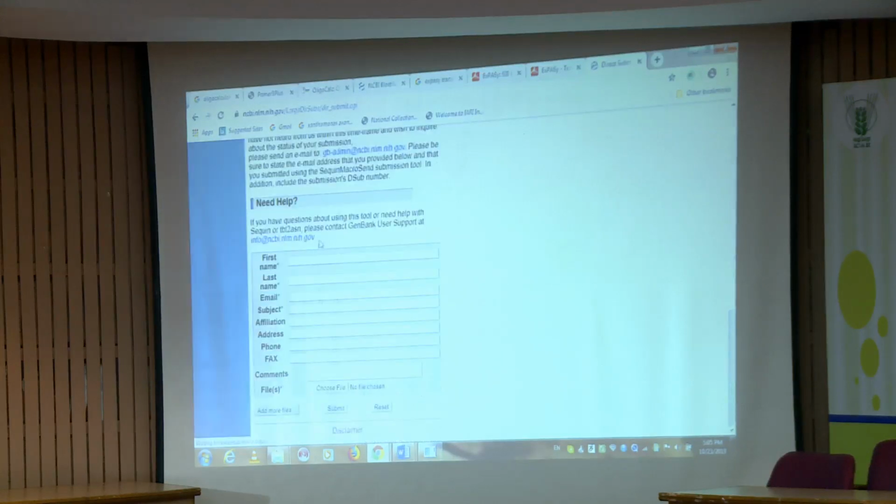This is that software. So this you have to do online. You have to fill in all the information, attach the file over there, and then simply submit. That is the only thing. So I hope the things are clear. If not clear, then please ask me.